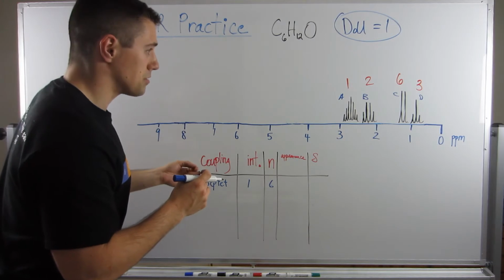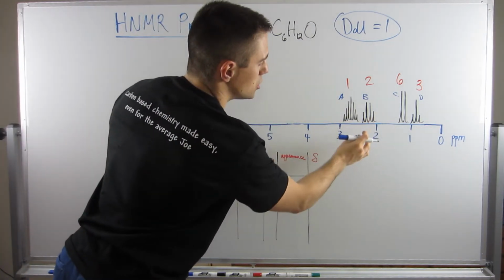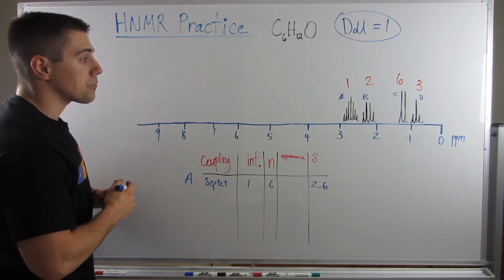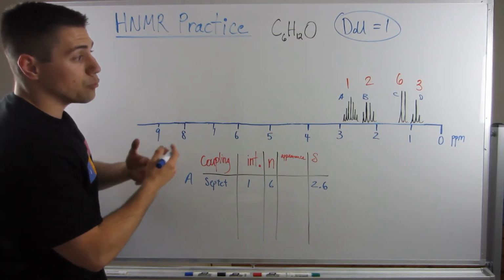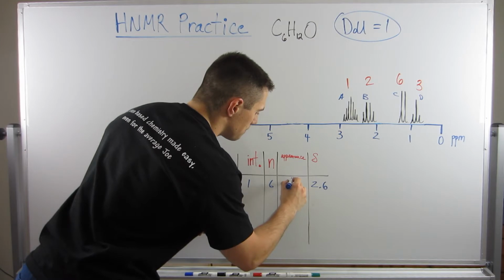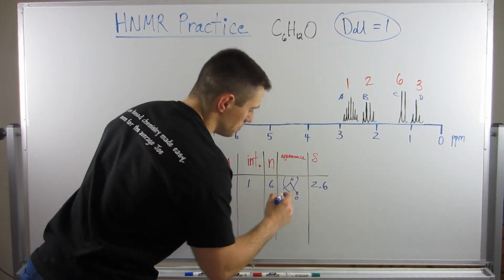Alright, so the appearance. And it looks like we have a chemical shift. Again, I had to put these in the same between 2 and 3. The chemical shift was really supposed to be like a 2.6, 2.5, somewhere around there. So, if it has 6 neighbors, and we're a little bit more downfield, right? If this is our hydrogen right here, we could be next door to a carbonyl.